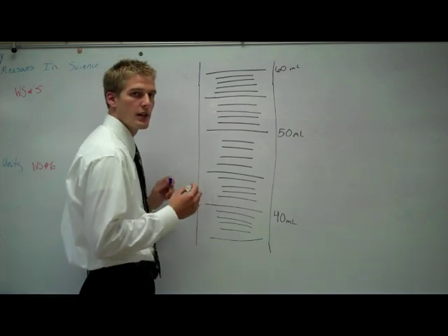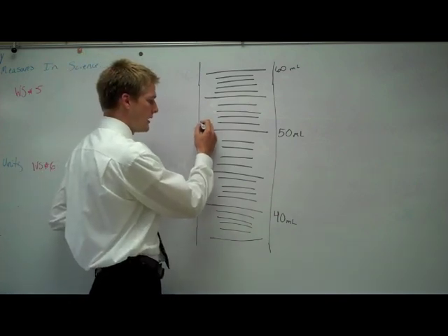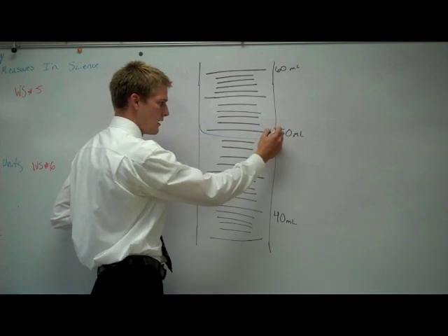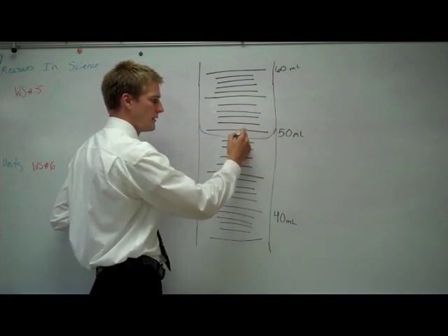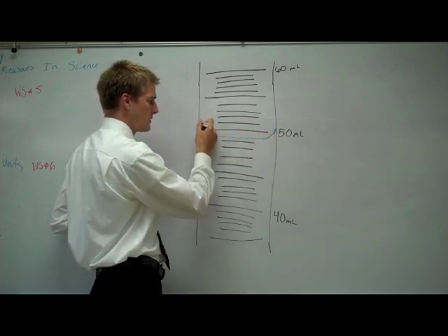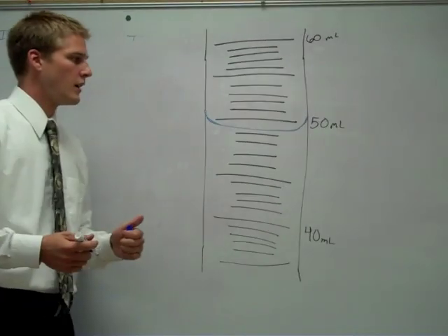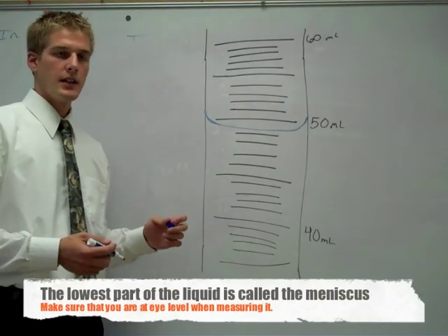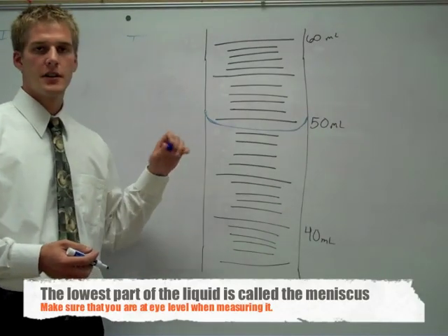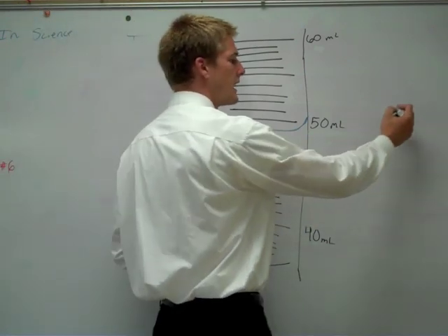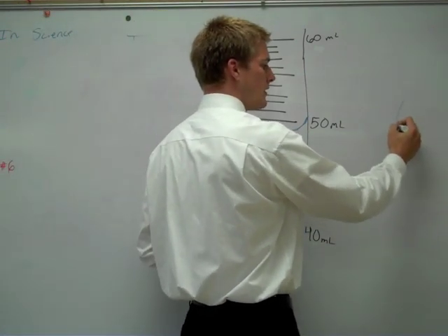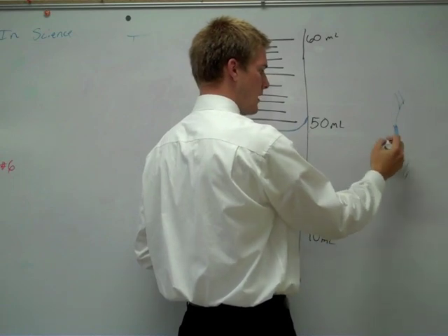Now, if we were to read what line this level was at, we need to make sure that we use the lowest part. So when you read the liquid, you want to read it to the lowest point, which is called the meniscus. You want to make sure that your eye is at the level of the meniscus.